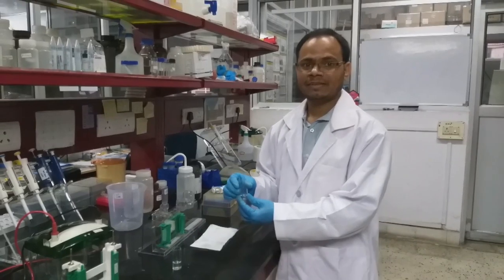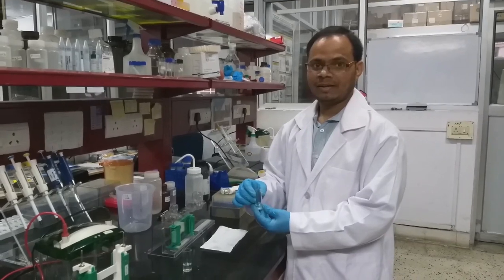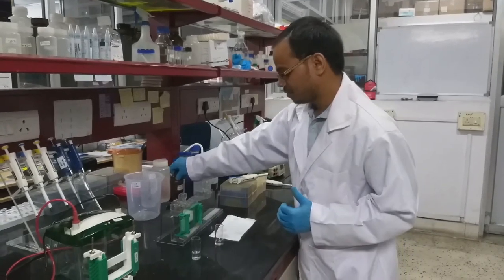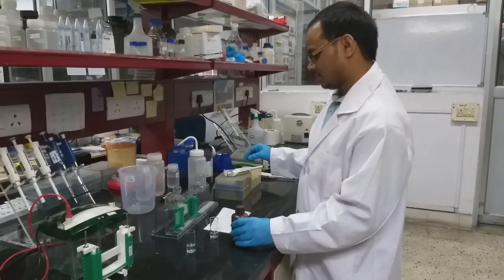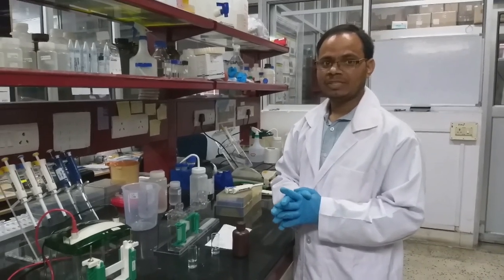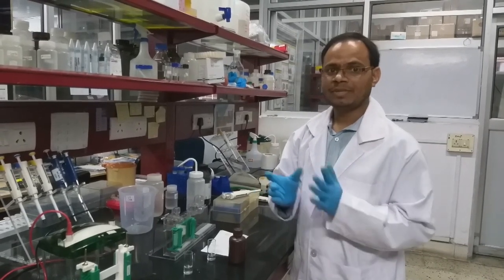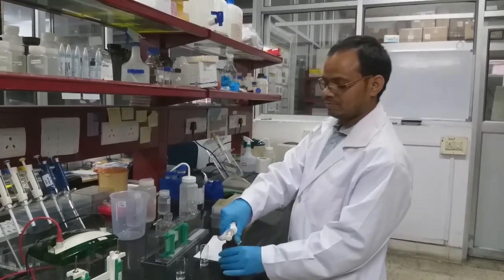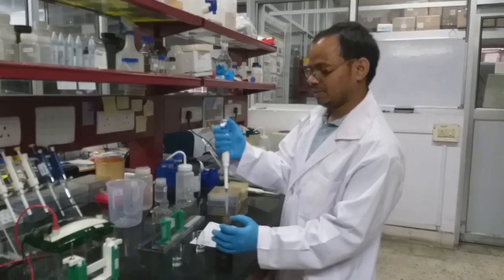This is just water. First I used water. I am going to add sequentially 4 ml of water. Now I have to add 3.3 ml of already prepared 30% acrylamide. Already in the introduction I explained how much percentage we have to prepare and how much quantities of acrylamide and bisacrylamide need to be taken. So here we have to add 3.3 ml of acrylamide solution, 30%.